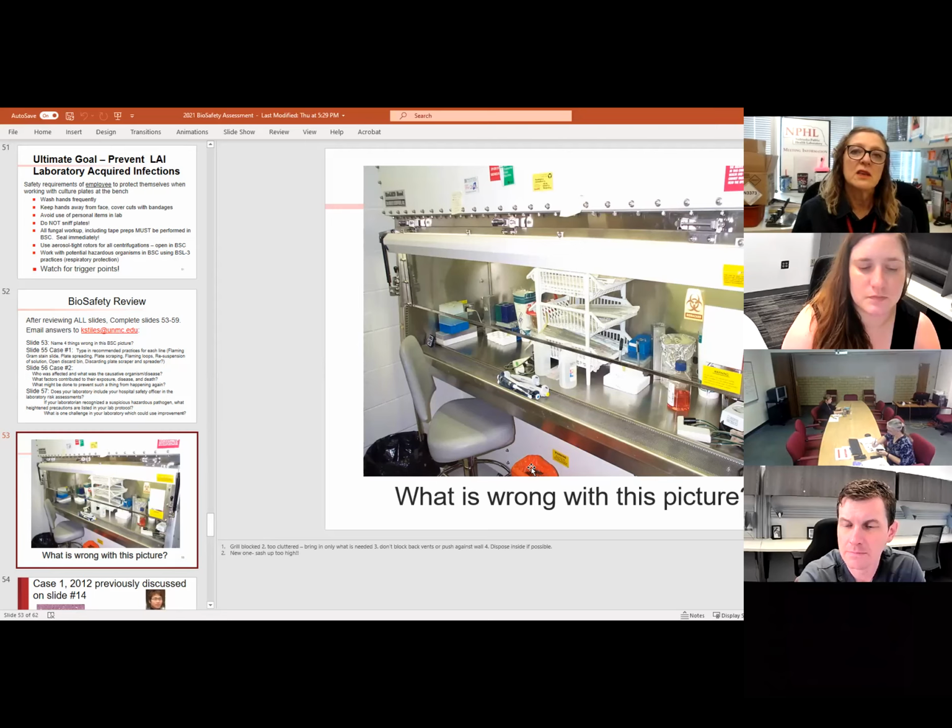It's something I did not know when I was in the clinical lab, and probably did a million times. But you think about it, you come out and let's say you think you're just gonna go get one item that you have forgotten. However, then you get a phone call, somebody needs to talk to you. And here you are, before you know it, you're touching something else. You have just come from the BSL-3 and now you're contaminating everything in your laboratory.